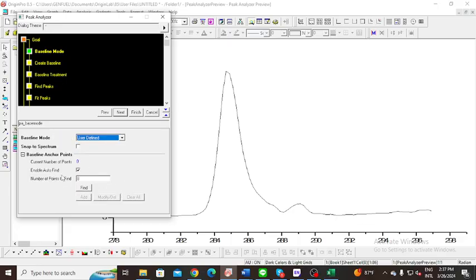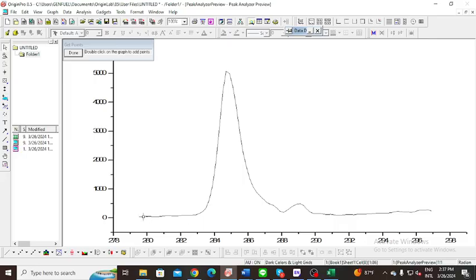And here we need to cancel the checklist, and we add the points by ourselves. We just choose here, Approximate, by double click, because if just one click, it's just like this, it doesn't add. So I need to double click.